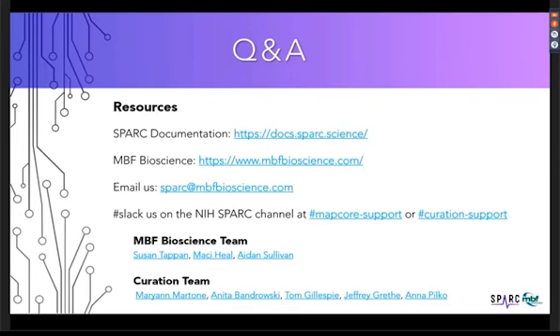If you are not currently accessing Neuro Lucida 360 or any of the other software that we offer to SPARC researchers and you would like to, please reach out to us. We want to get you using the software so that you can promptly and efficiently move your data through the SPARC data pipeline for fitting to scaffolds.